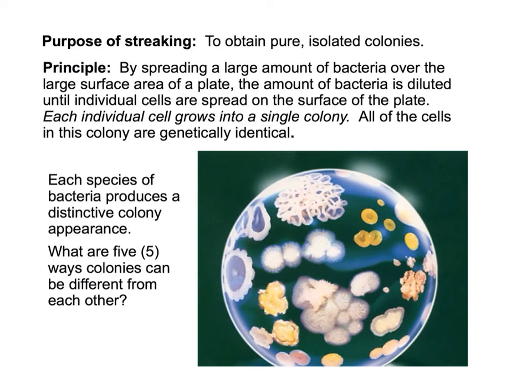The goal of this video is to review the proper procedures for streaking a bacterial plate. The purpose of streaking a plate is to obtain a pure, isolated colony.